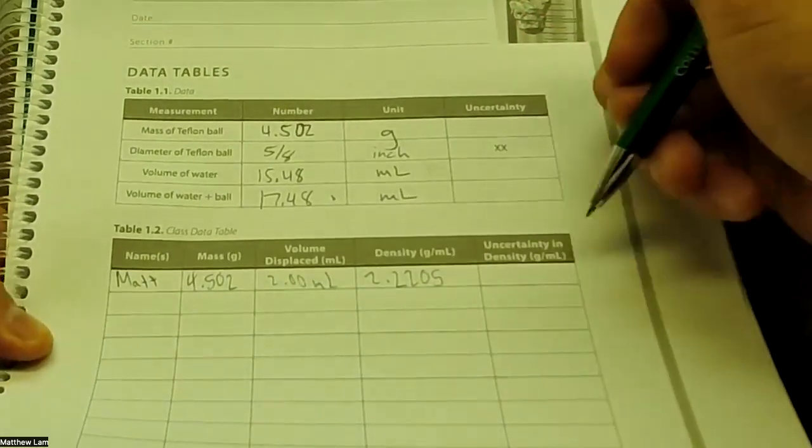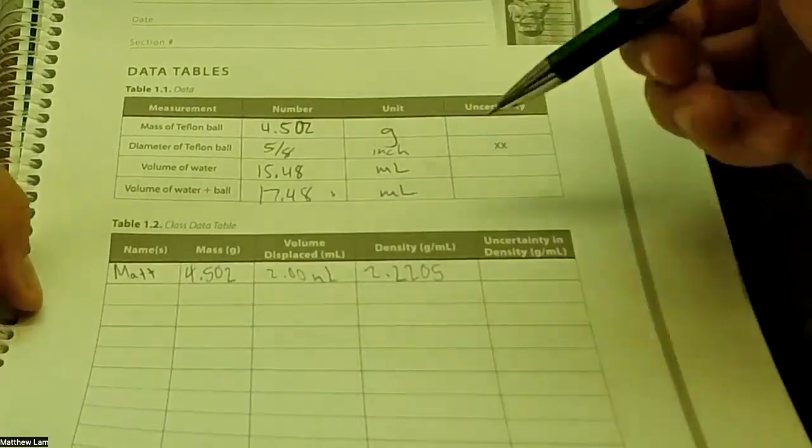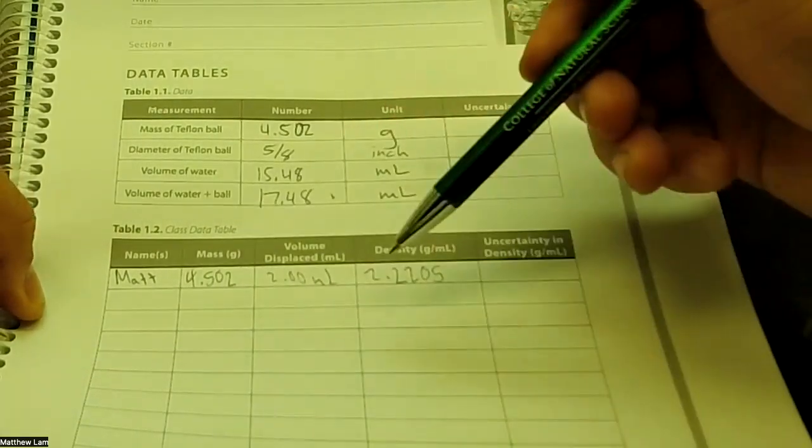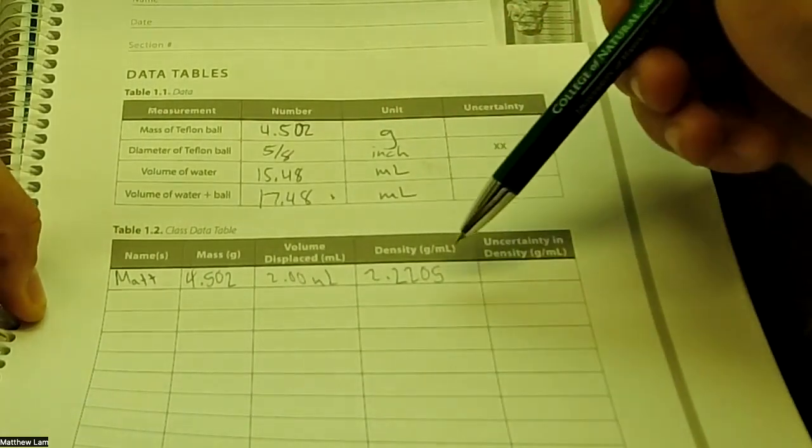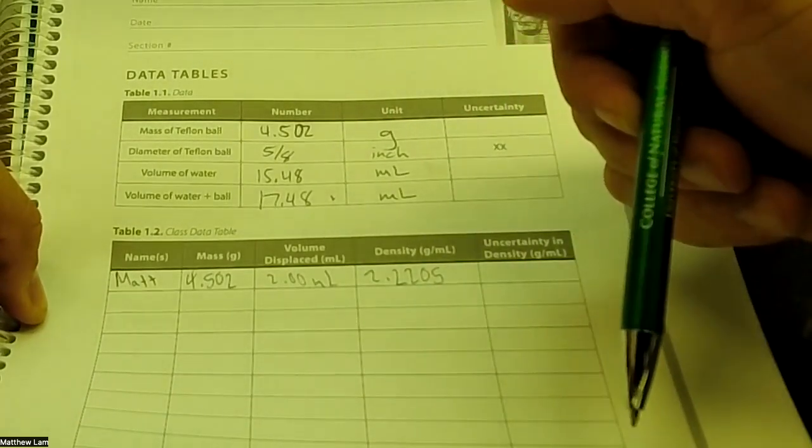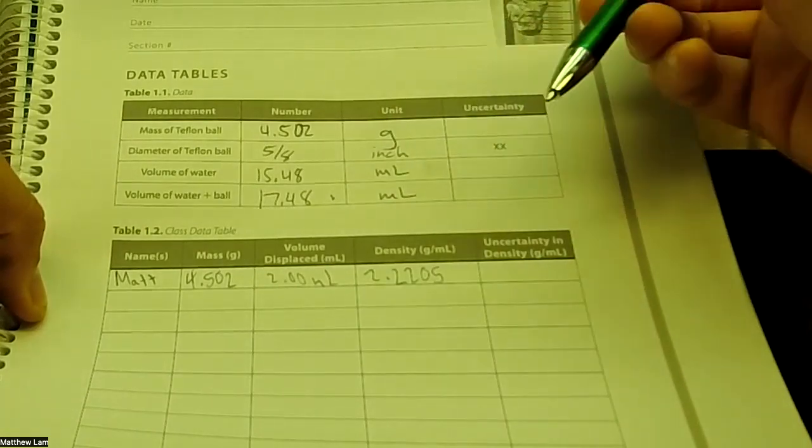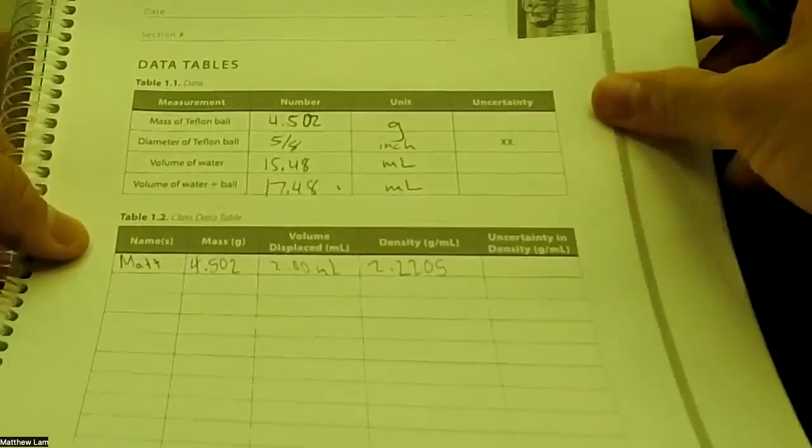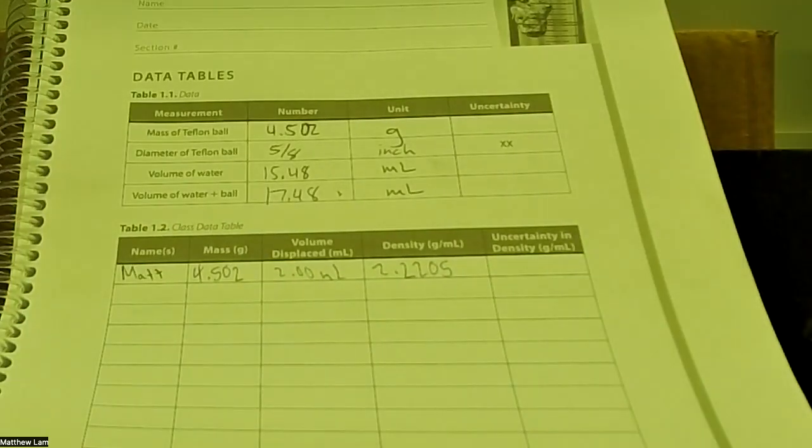And then your TA can show you how to do uncertainty. Now your TA should give you class data for this so that you can determine the densities for your whole class and the uncertainty value. So you can do the second part, the Excel part, for this experiment. That is it for this experiment. If you have any questions, please ask your TA. Thanks.